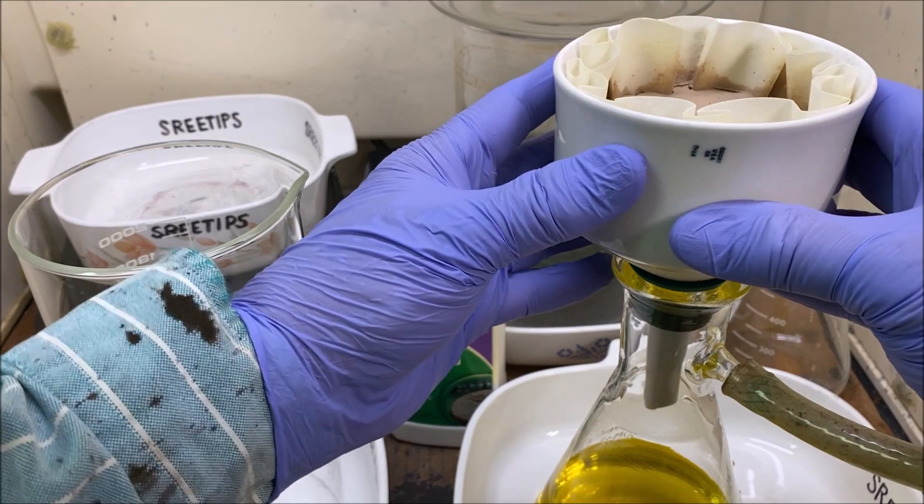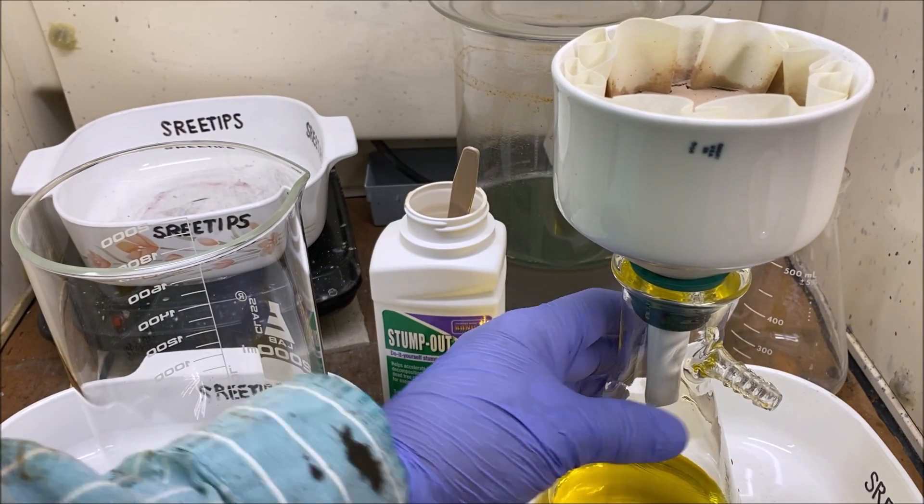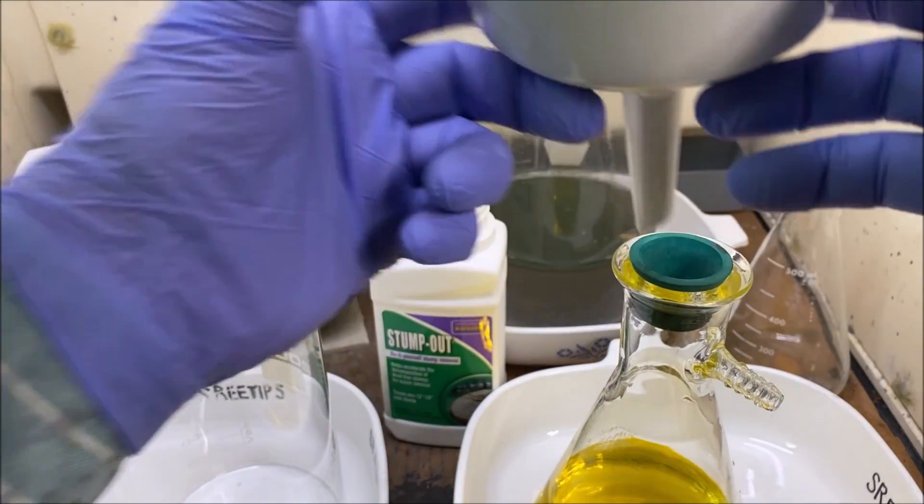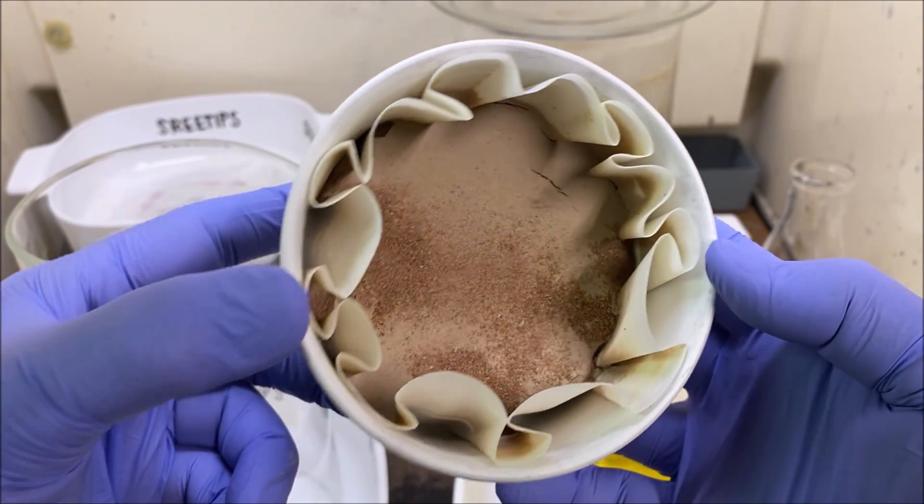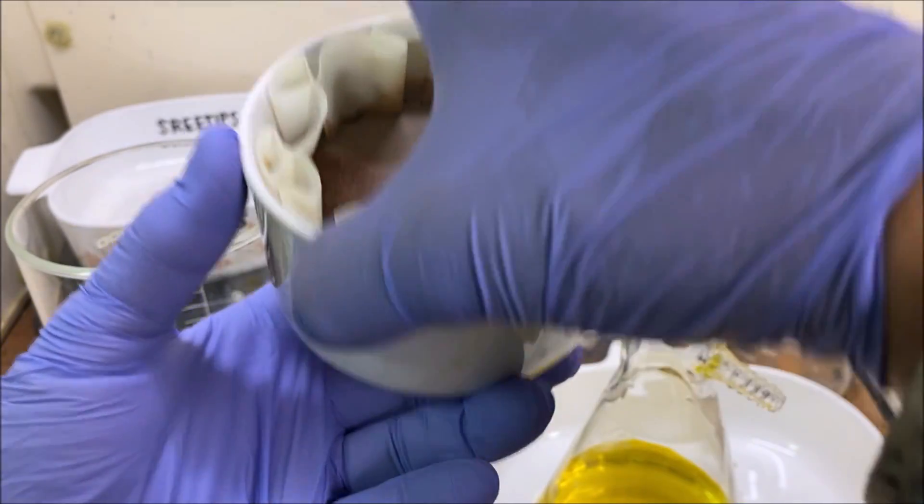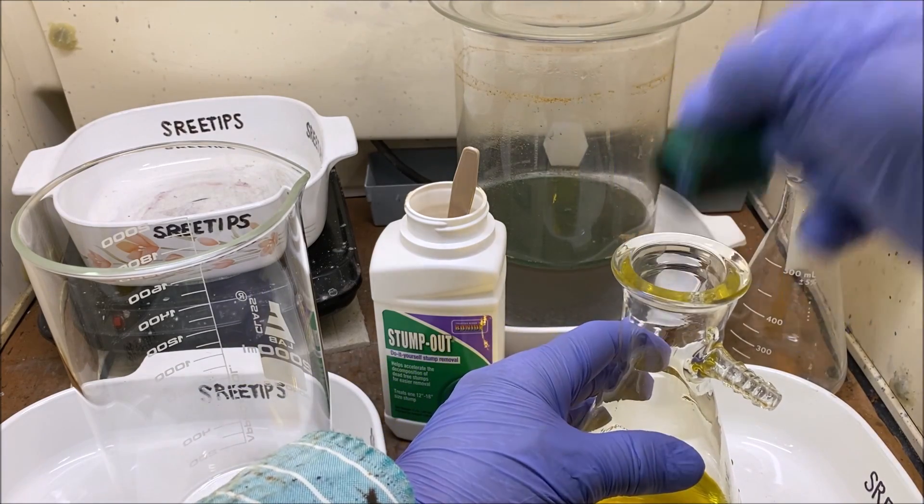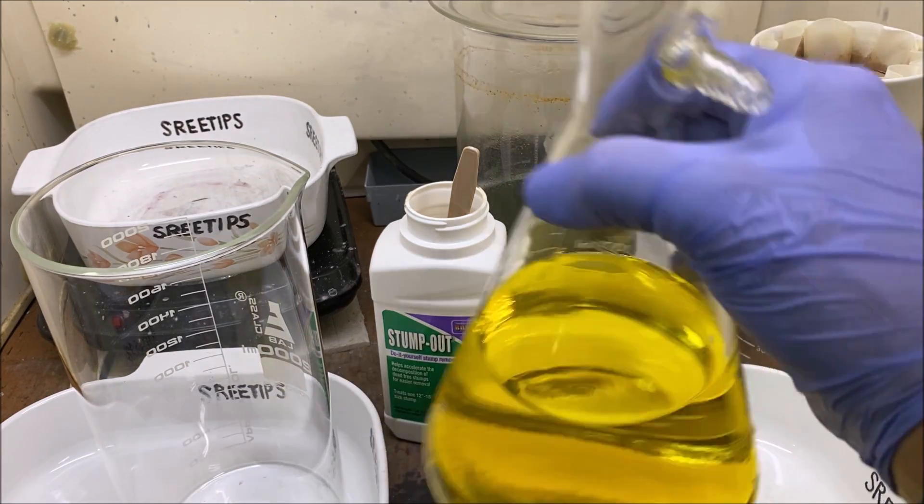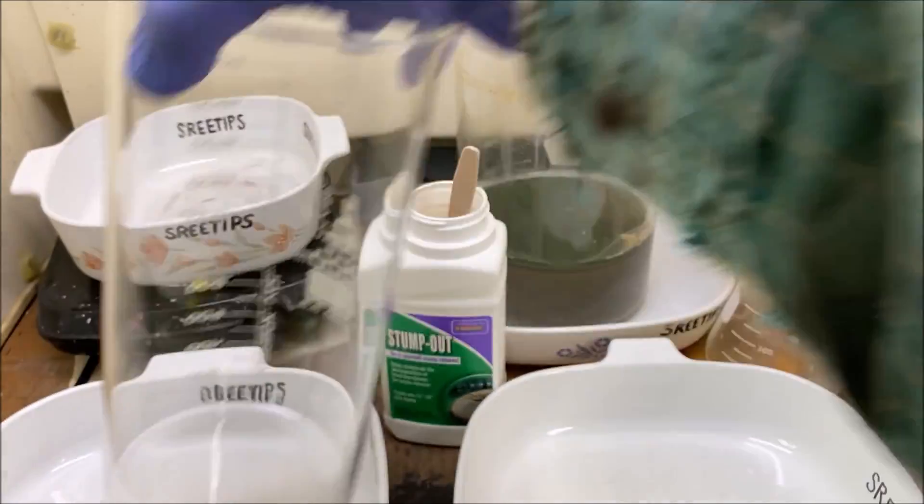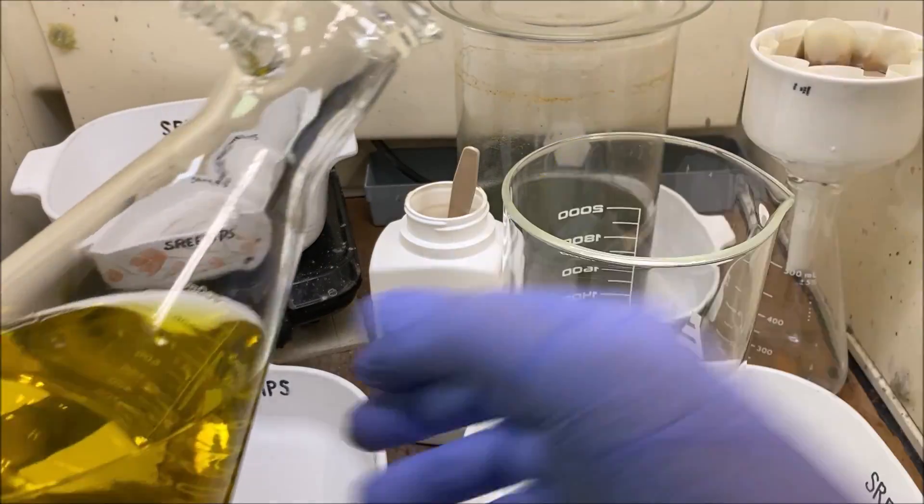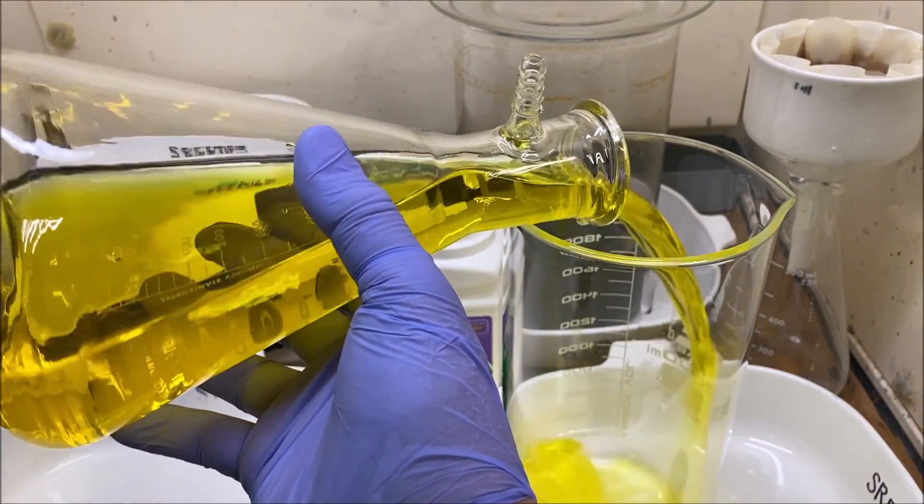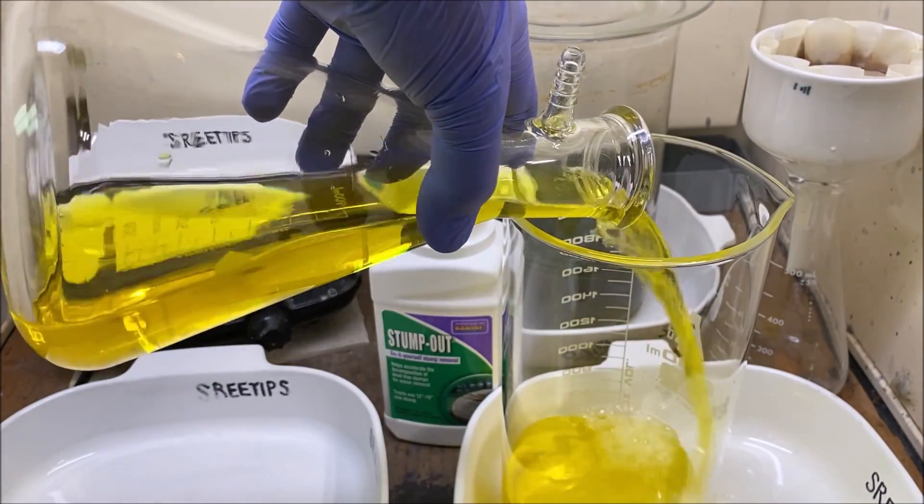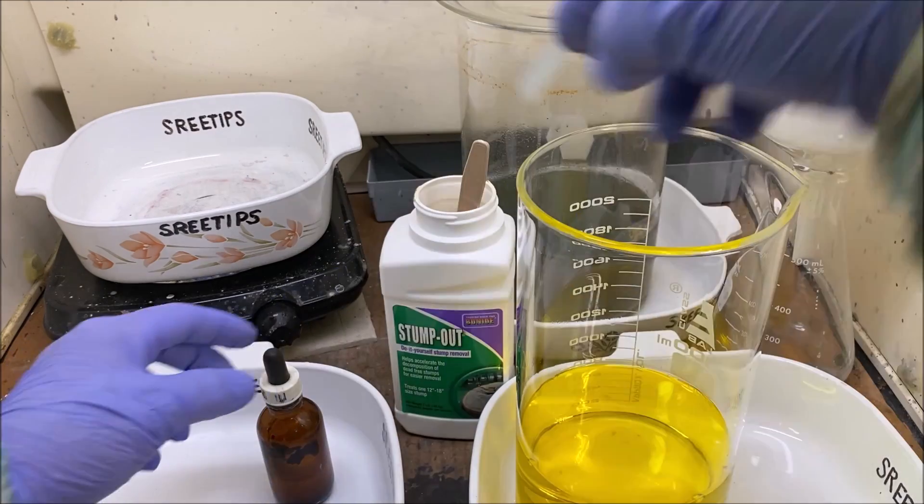I've got the solids all rinsed off in this funnel until the filtrate began to run colorless so we've got all the gold rinsed off here. Now what we'll do is add the gold solution to a clean beaker here. Let's test it with stannis, make sure we got gold in solution.